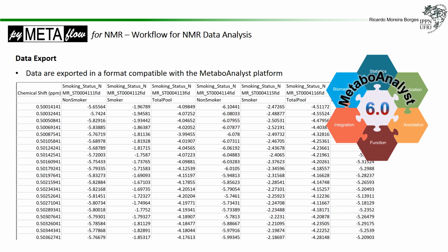But if the alignment works nicely, you can go for full resolution, and the results are really much better. So you can feel free to use pyMETAflow just for the alignment case, but we'll go ahead and do the data analysis from here, because you can easily do PCA and PLS-DA from here directly.